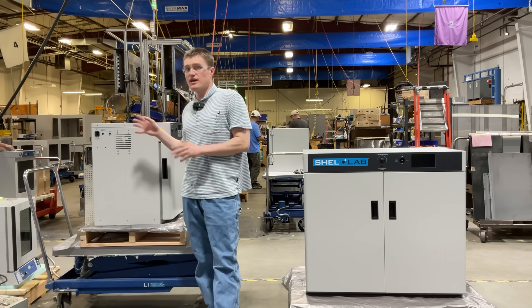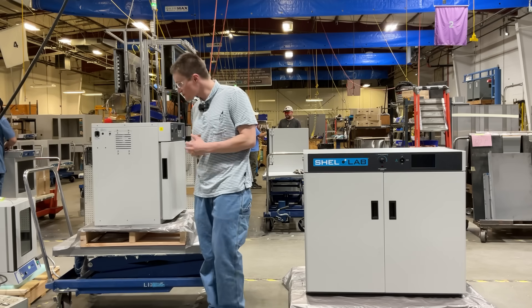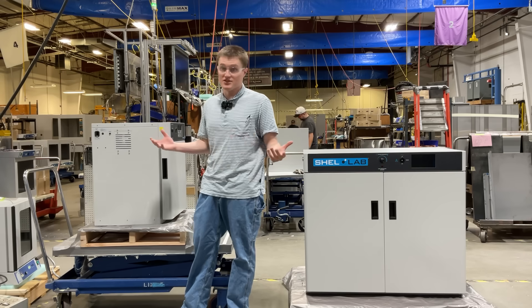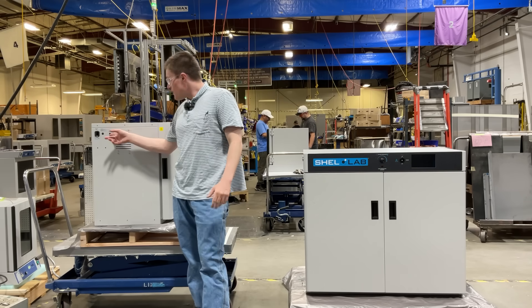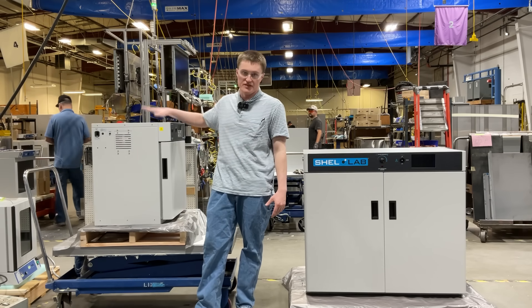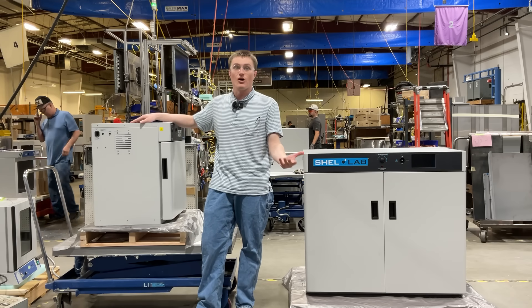Each unit must be connected to a properly grounded electrical outlet using the included power cord. For further information related to electrical safety and installation requirements, such as clearances, please visit the user manual. The other component on this side is the expansion port. This is used to power any 24 volt devices that are compatible with this unit. For a full list of compatible accessories, please visit our website.